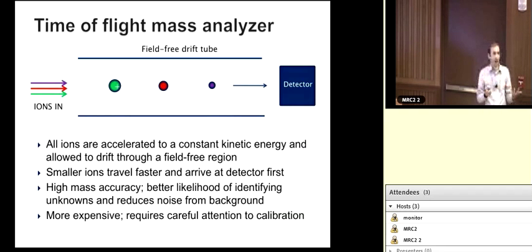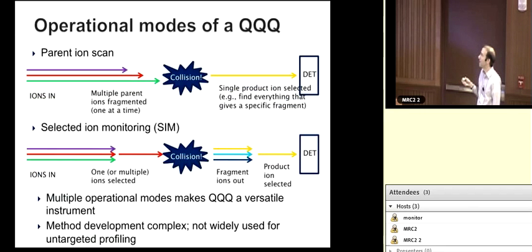Okay, so how are we going to do MSMS? Well, we need an instrument that's capable, and the most basic, most common one that's used to do MSMS is called a triple quadrupole, or a QQQ. So you may hear people talking about that. It's widely used. It's robust technology, and basically you take three quadrupoles in a row. The first one is designed to do the mass filtering, as we already talked about. The second one, they call it a quadrupole, but these days it's usually a hexapole, is where your collisions happen, where your ions collide with others, and this just provides a guide for the ions and a space for that to happen. And the third quadrupole is another mass filter.